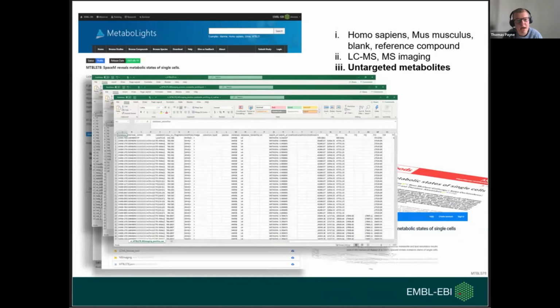And then from the metabolite sheet, we can see that there were 1,446 rows. So these are metabolite features, peaks, unknowns. Actually, the majority here were assigned to a ChEBI ID. So then we have the chemical formula, the SMILES, the InChI, as well as any descriptors associated to the mass spec assay, and potentially any quantitative values.